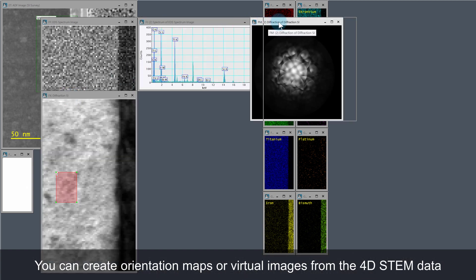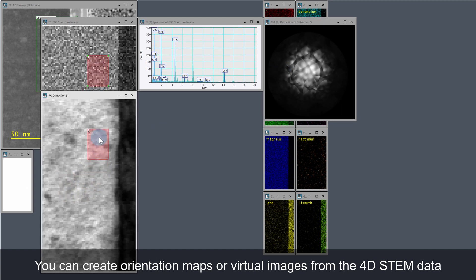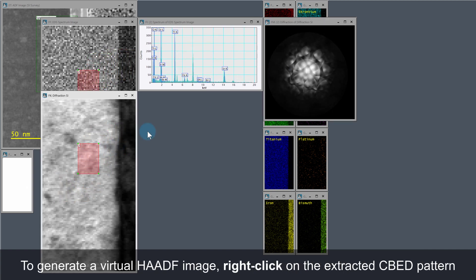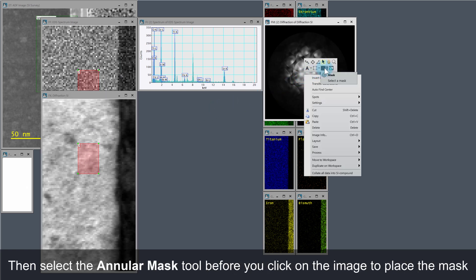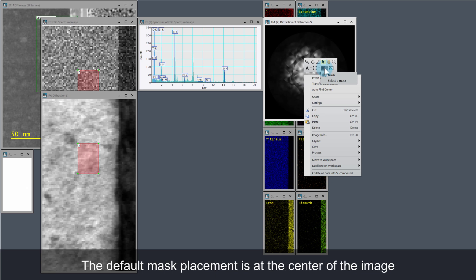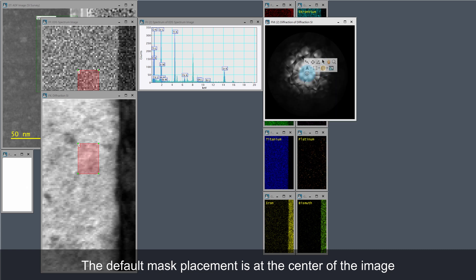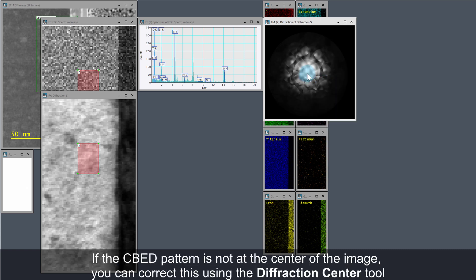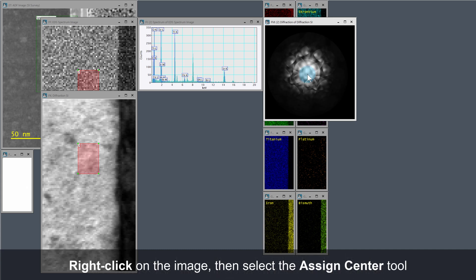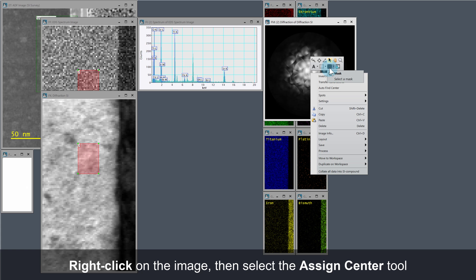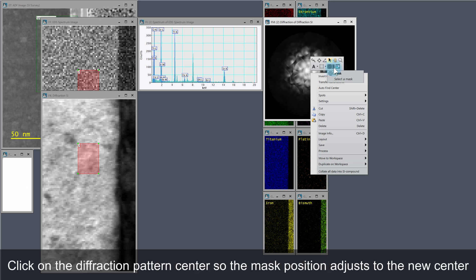Orientation maps or virtual images can be created from the 4D STEM data. To generate a virtual HAADF image, right click on the extracted CBED pattern and select the angular mask tool, then left click on the image to place the mask. The default mask placement will be at the image center. This CBED pattern is not centered at the image center, but this can easily be corrected using the diffraction centering tool. Right click on the image again and select the assign center tool, then left click at the diffraction pattern center and the mask position is adjusted to the new center.